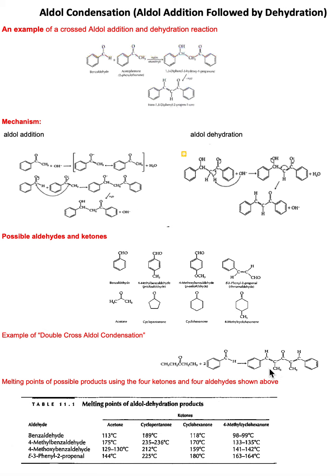The solid products will be purified by recrystallization. In this experiment, you'll have to determine if a single or mixed solvent needs to be used for recrystallizing a particular product, and if a mixed solvent is used, what ratio of the mixed solvent is needed.